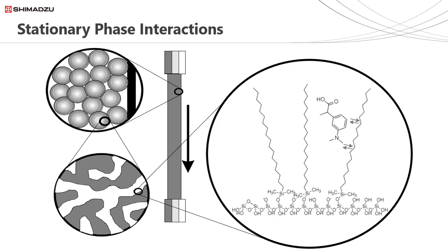These are weak, transient interactions between a non-polar stationary phase and the analytes, and are typically predicted by log P values. Ionic interactions are between ionizable functional groups on analytes and countercharged species on the stationary phase. Ion exchange interactions are strong, slow interactions and can hugely affect peak shapes in reversed phase HPLC.